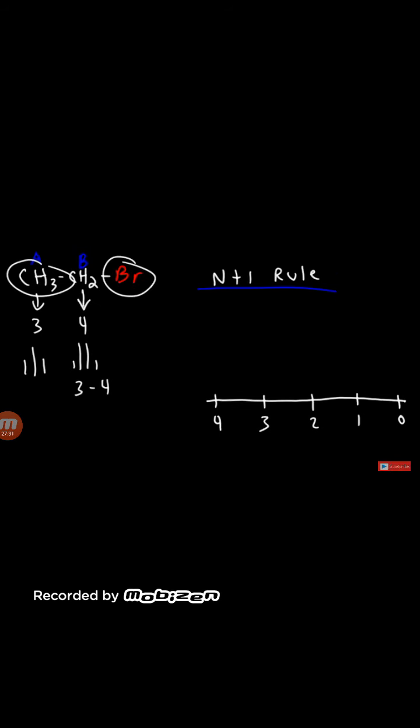On 1-ish, but because of the presence of this electron withdrawing group, it turns out that an ethyl bromide is going to be shifted downfield to about 1.6. So let's draw the signal for the methyl group. So around 1.6, we're going to have a triplet. And so we're going to get something that looks like that. Let me use a different color. My drawing is not perfect, but you get the point.